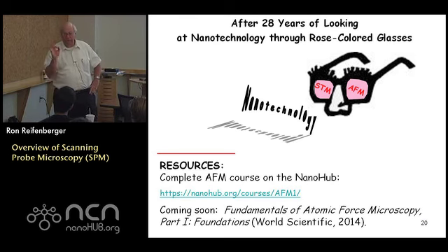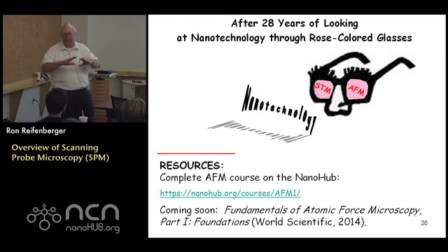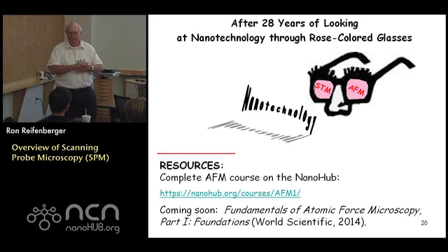So what you have to do is be very careful that the voltage you apply to move the tip doesn't leak onto the tip itself, right? So you just have to build insulating layers and electrically isolate things very well. But when you build these instruments like we did back in the 80s, those were all kinds of issues because it's like, oh, geez, there's a short. Where's it at? I don't know. And then you'd have to figure it out. But a lot of that's taken care of now by the companies because they make these things now and all those details are sorted out.